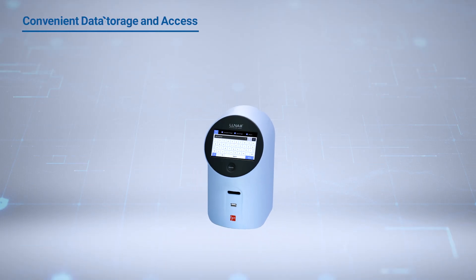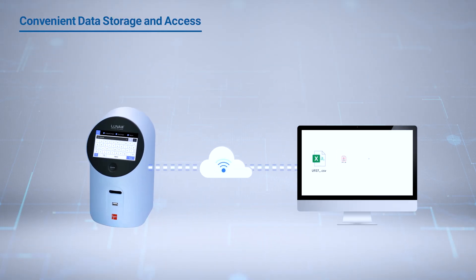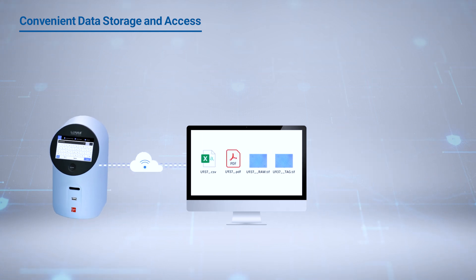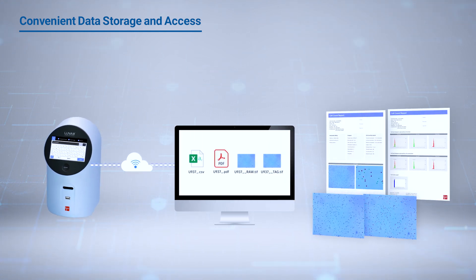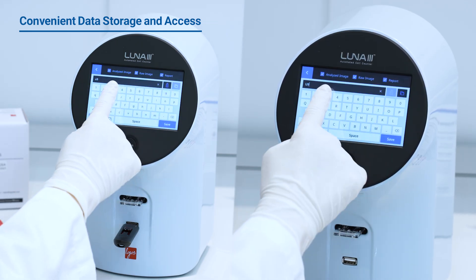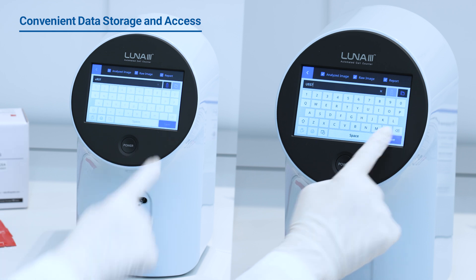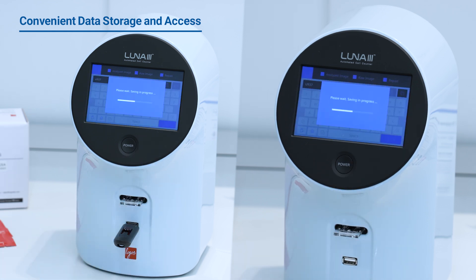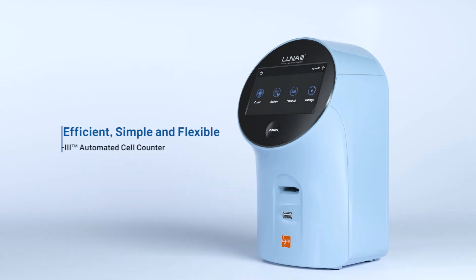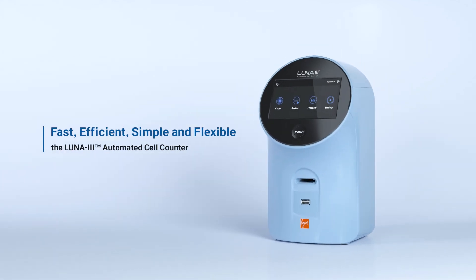Manage your data seamlessly with the Luna 3. With USB and internal storage, you can easily access and transfer files over the network at any time, ensuring flexible and efficient data management. The Luna 3's data can be stored internally, transferred via USB, or sent over Ethernet server in PDF format. Fast, efficient, simple, and flexible.